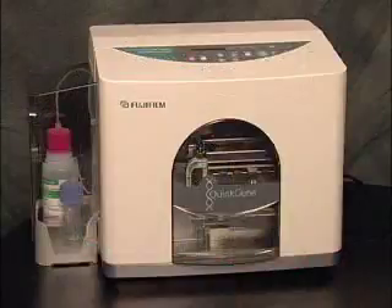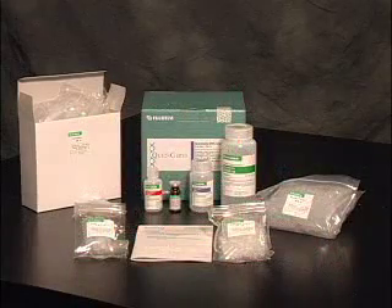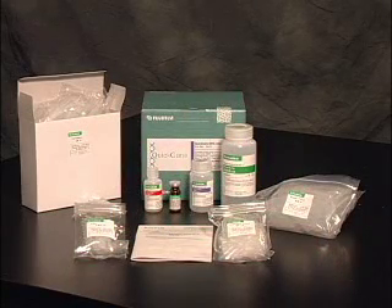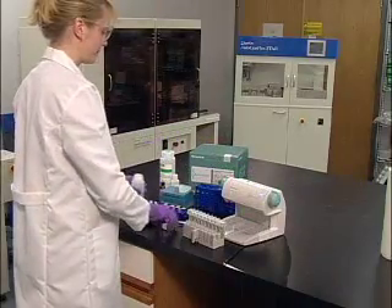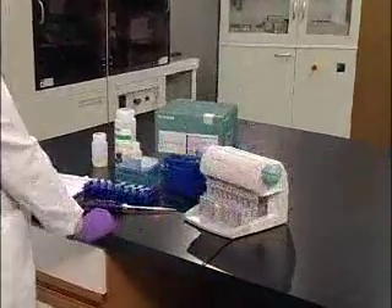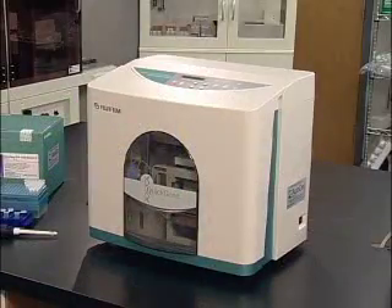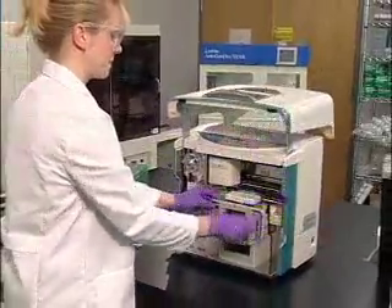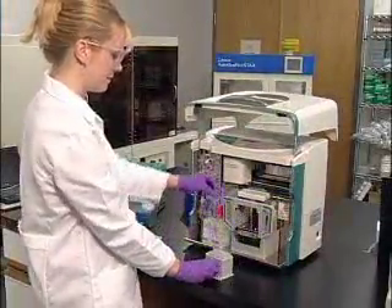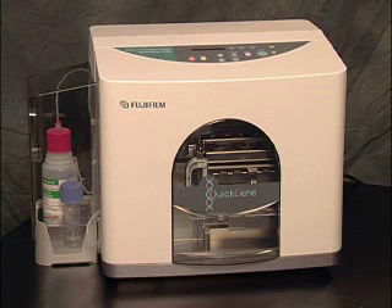The Quick Gene series includes the Quick Gene Mini 80, Quick Gene 810, and the Quick Gene 610L. All three instruments utilize the same Quick Gene kits for consistency and reproducibility across a variety of starting materials and experiments. Offered at an affordable price, the Quick Gene Mini 80 is a small and lightweight personal nucleic acid isolation device that takes up minimal space on the lab bench and can run one to eight samples at a time. The Quick Gene 810 is a versatile semi-automated system that can process up to eight samples in as little as six minutes. The Quick Gene 610L is specially designed for isolating nucleic acids from large volume samples and can isolate DNA from two milliliters of blood for up to six samples per run in just 12 minutes.